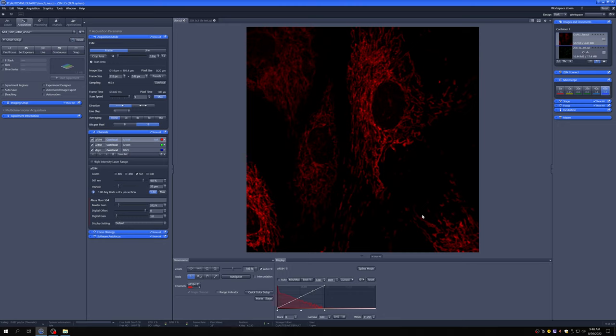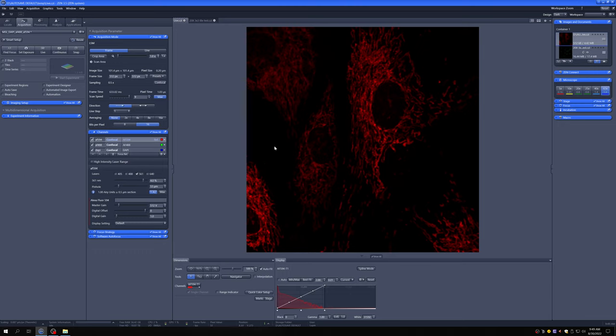First we're going to discuss settings that can affect the contrast of the image, how well we can see things that we know are real, in this case the mitochondria versus the background. And then we're going to talk about things that can affect the resolution, the level of detail we can see in the sample.